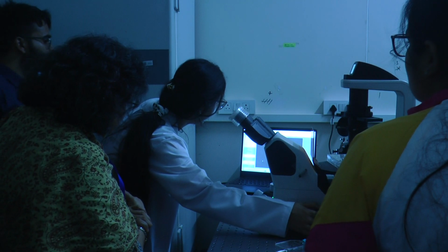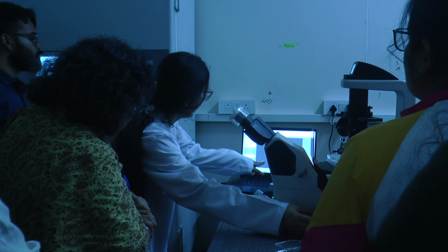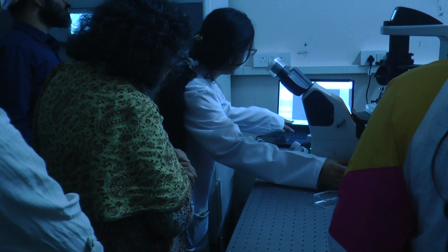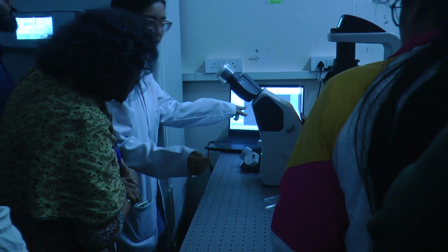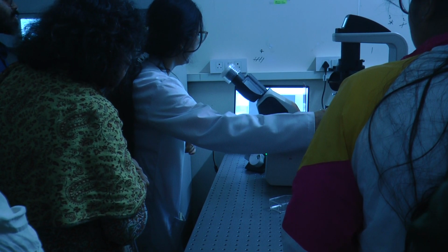Vesicles have been formed, see, they are moving. They are all vesicles. There are many.